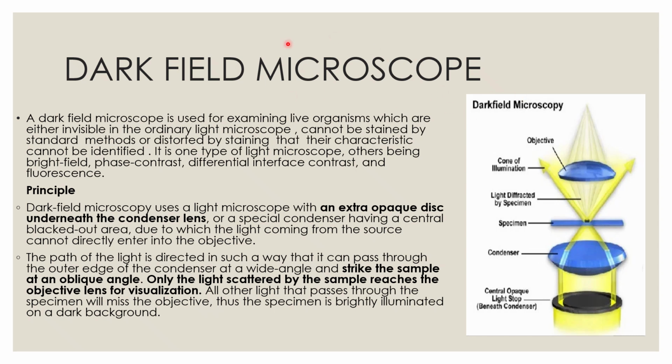As the name tells, dark field means that when you observe the specimen under this microscope, the background appears completely dark or completely black and the specimens will be illuminated. That's the reason we call it a dark field microscope. So when do we use this dark field microscope?